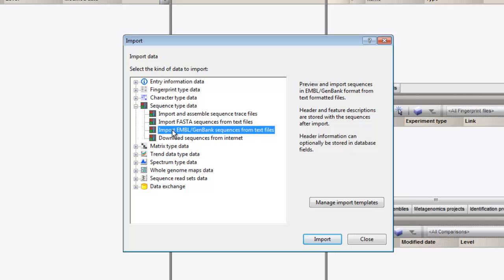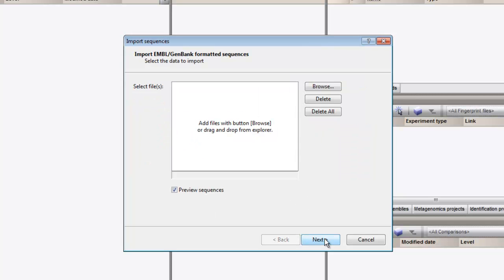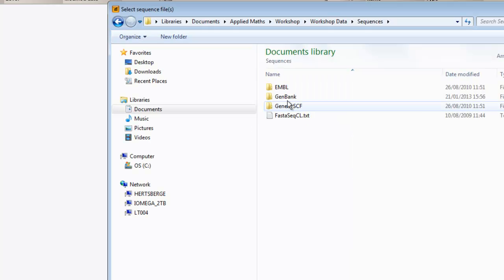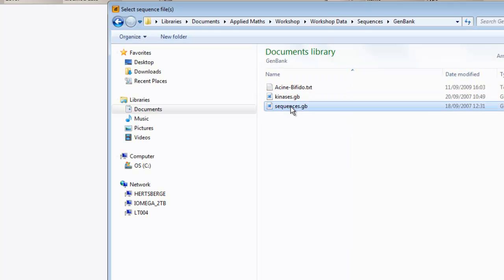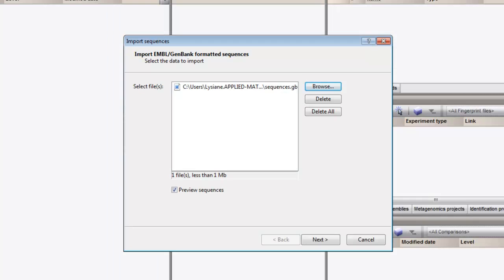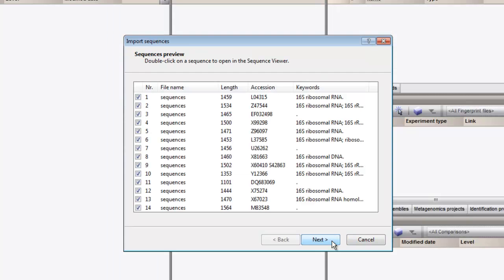We click on Import and browse for the file. The next window lists the sequences found in the file.